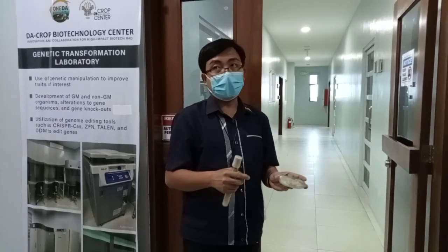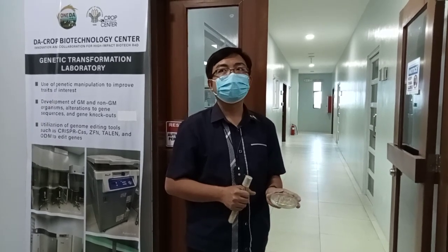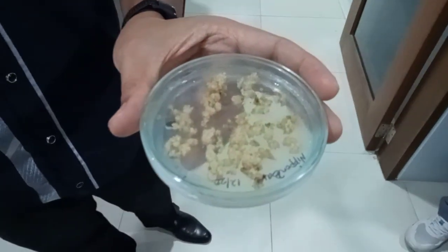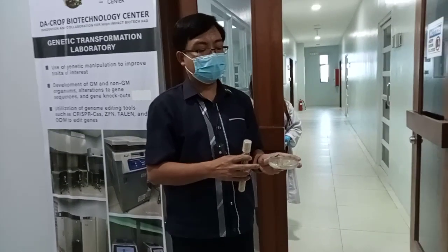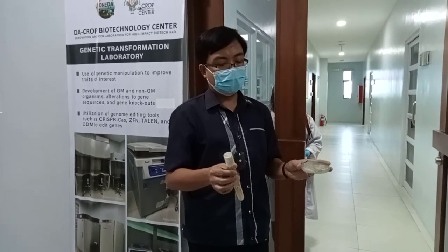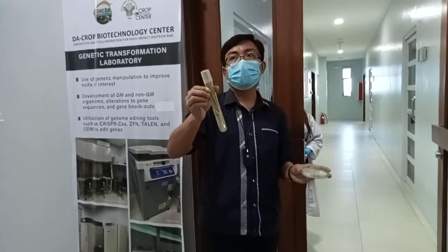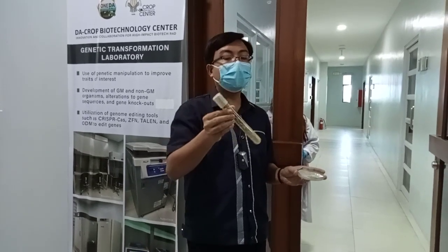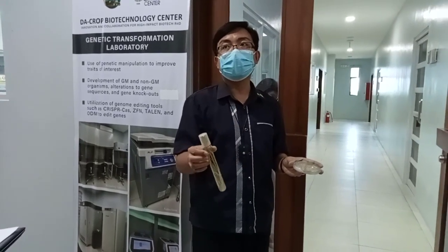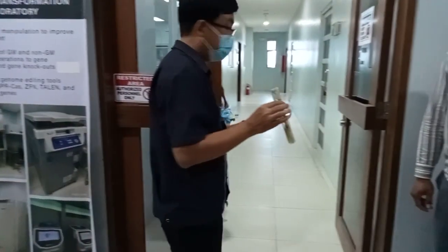And then so we will select the transformants, so that the plant will be able to grow in medium with antibiotics. Normally, when there's antibiotic, the plant will be dwarf or stunted or will die. So basically, that's what we do here.